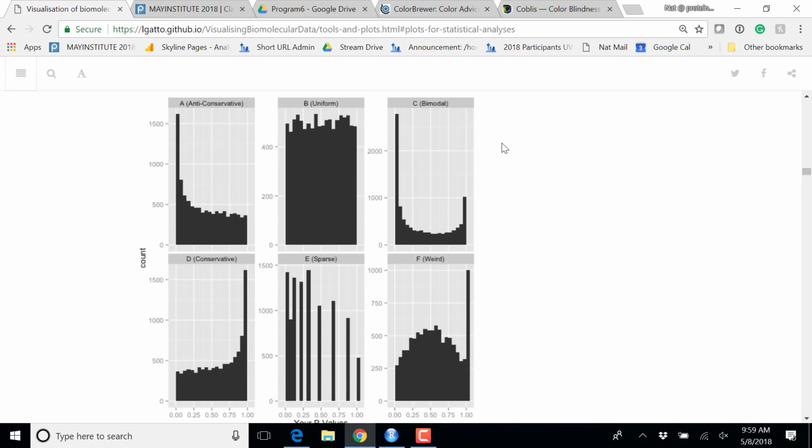Same thing here. This is weird. In this case, there is no increase of small p-values, but it is weird to have this enrichment in big p-values. Maybe here the p-values you are looking at are already adjusted. Slightly more weird cases when you have a sparse distribution of p-values. This could be the case if the test used some bootstrapping, kind of resampling, and there weren't enough iterations.